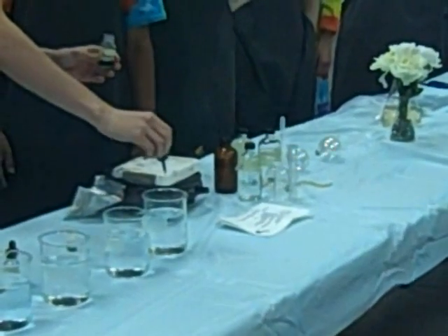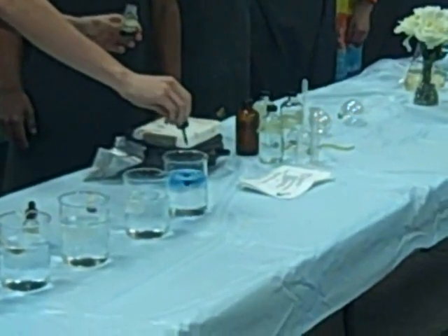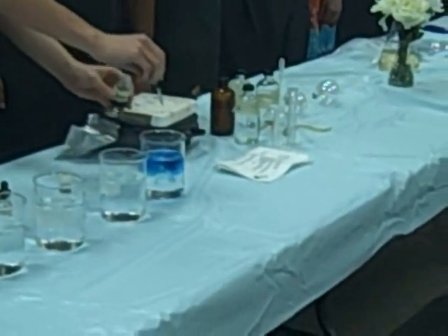Each one, I've got a couple drops of ammonium hydroxide, which will make it basic. So it should change colors like so.